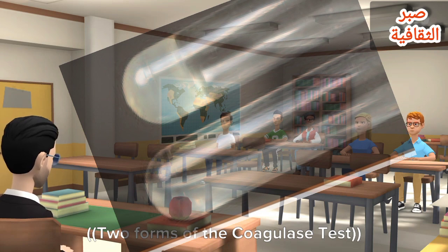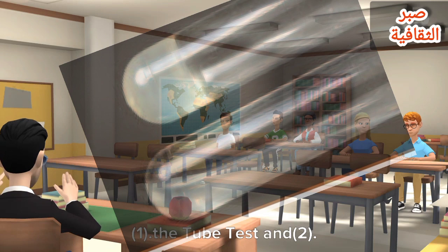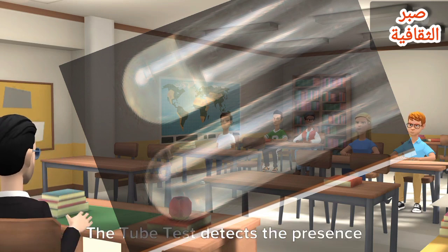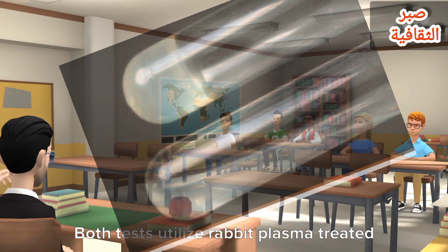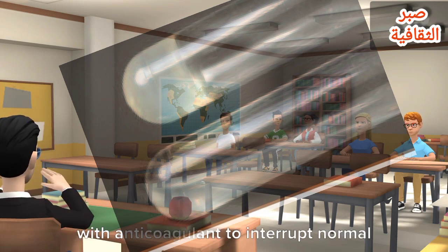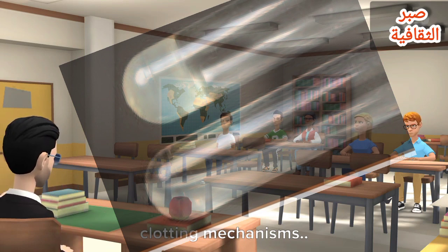Two forms of the coagulase test have been devised to detect the enzymes: 1. The tube test and 2. The slide test. The tube test detects the presence of either bound or free coagulase, while the slide test detects only bound coagulase. Both tests utilize rabbit plasma treated with anticoagulant to interrupt normal clotting mechanisms.